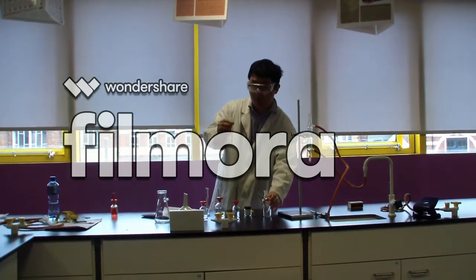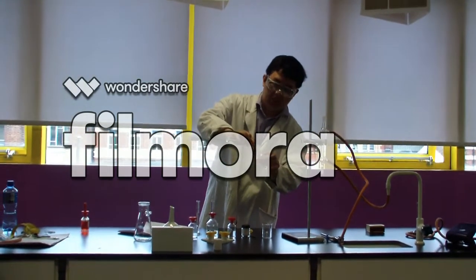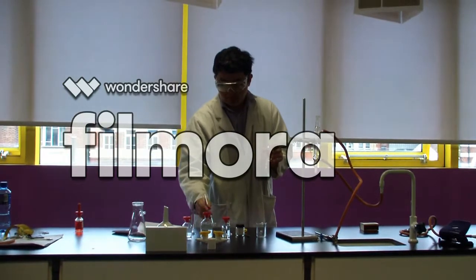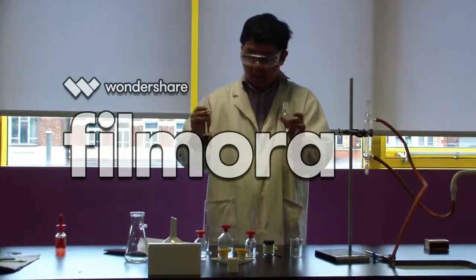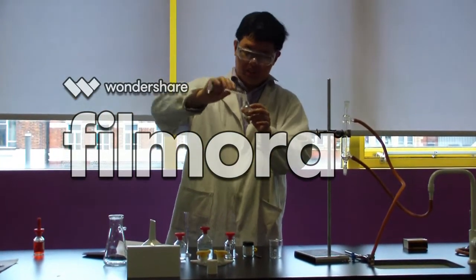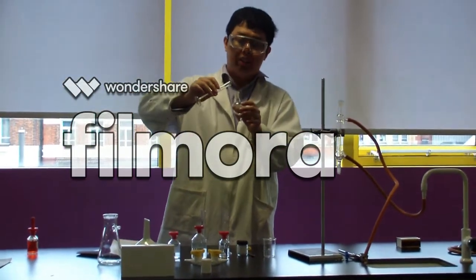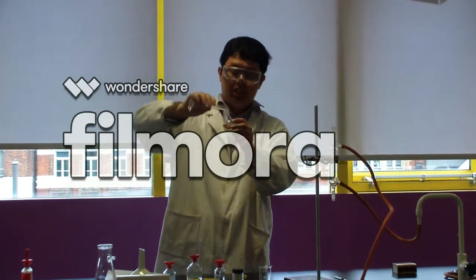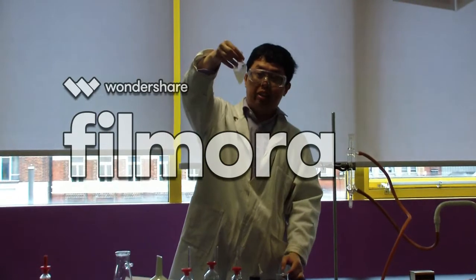So I put 2 ml of the methyl benzoate, which is the reagent, 10 ml of the ethanol, which helps mix the methyl benzoate and the sodium hydroxide, and 10 ml of sodium hydroxide, which is one of the other reagents. As you can see, when I mix it, there's 2 layers.